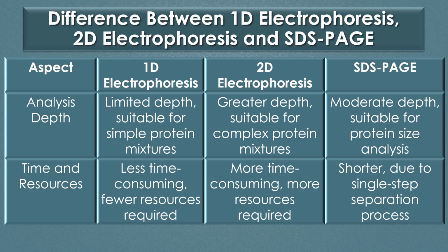Analysis depth. One-dimensional electrophoresis has limited depth and is suitable for simple protein mixes. Two-dimensional electrophoresis has a greater depth and is suitable for complex protein mixes. SDS-PAGE has a moderate depth and is suitable for protein size analysis.